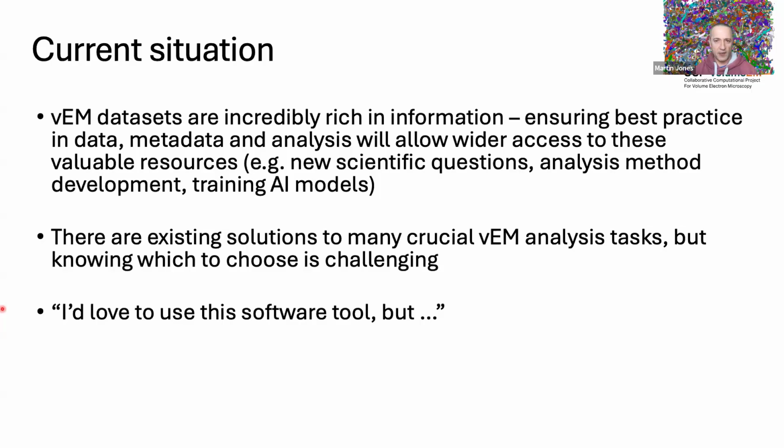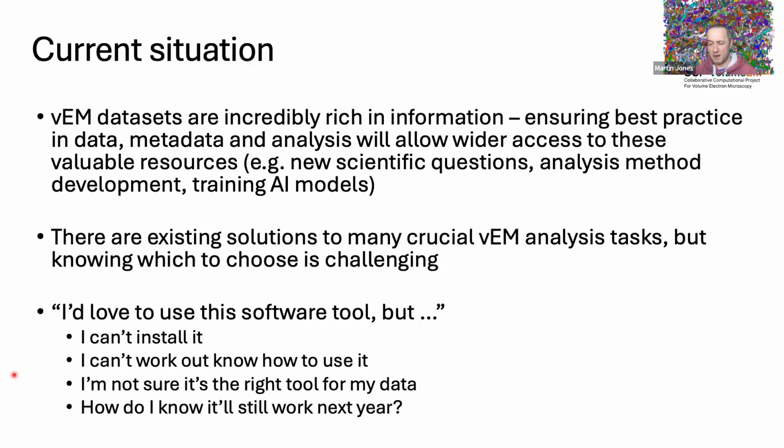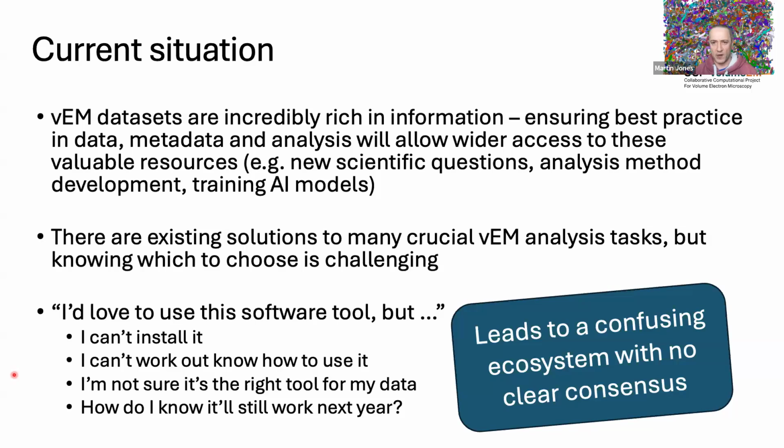And a lot of things we do, there are solutions out there, good solutions, but knowing what software to use and what methods to use is challenging. And we often hit this problem of, oh, I've seen this software, I'd love to use it, but I just can't get it to install. I don't really know how to use it when it does install. I don't quite know if it is the right tool. I know this was written by a PhD student who's moving to industry next year, so will this still work next year? That kind of thing. And it's led to quite a confusing ecosystem, and there's no clear consensus on how to do a lot of the necessary processing for volume EM.